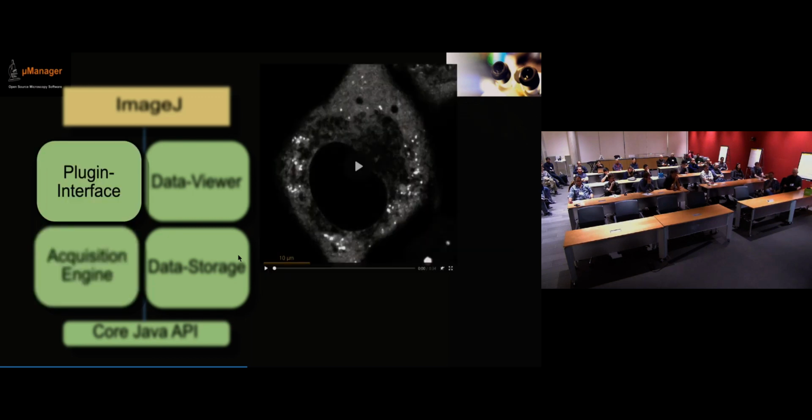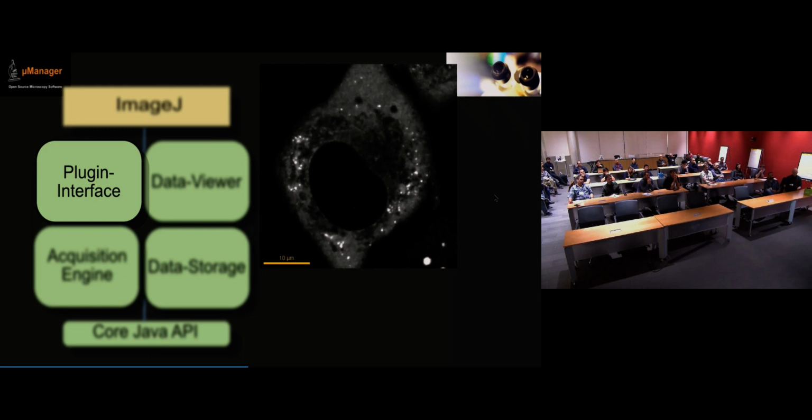Now the plugin interface. For me, that thing has been a big joy. I've written quite a few, and it's a lot of fun because here you can really start doing creative things with your microscopes. This is an example of something that a postdoc in our lab is now working on, where she is photobleaching these moving particles with a Galvo device.